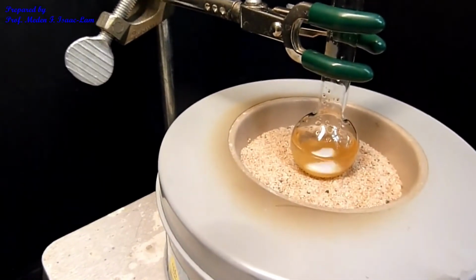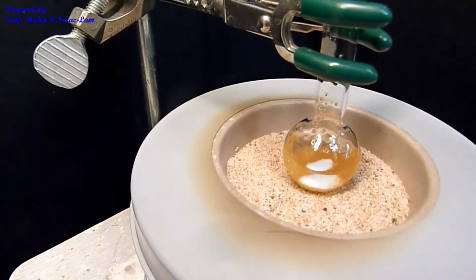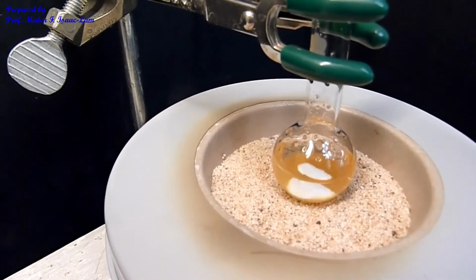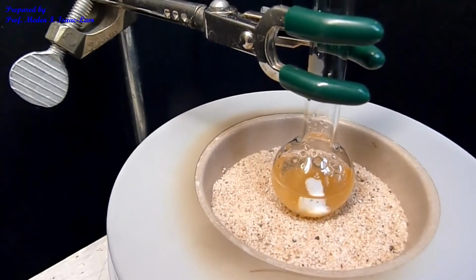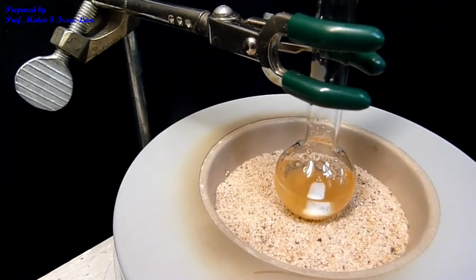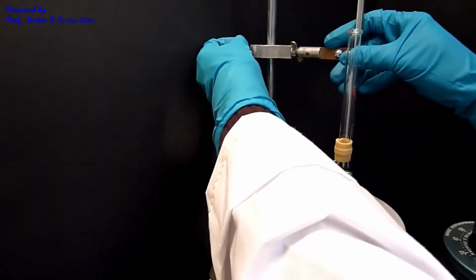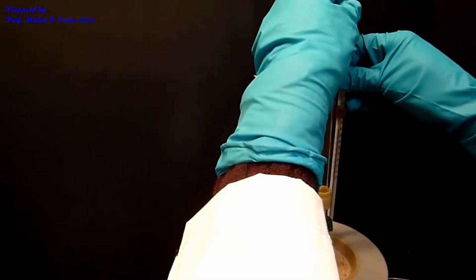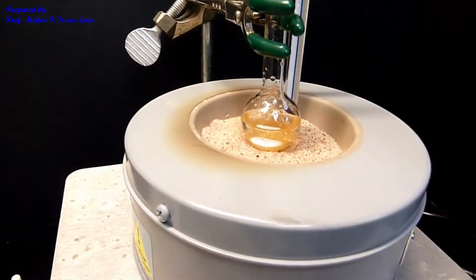So right now I'm stirring it so that the solution would mix. And right now we have three things in here. The alcohol, the acetic acid, and then the catalyst, which is the resin. So I can measure the temperature so that I know that I'm not heating it too much, otherwise it might dry up. And I want it to be approximately 140.